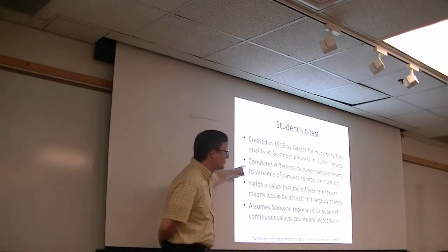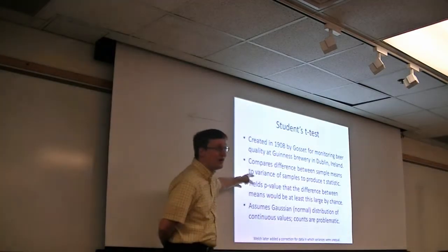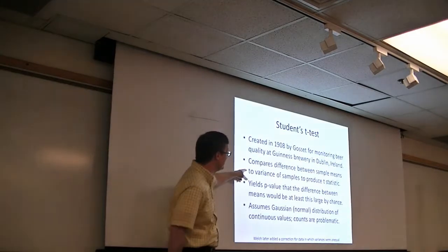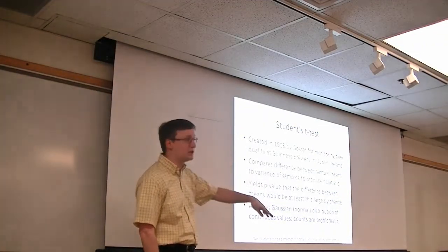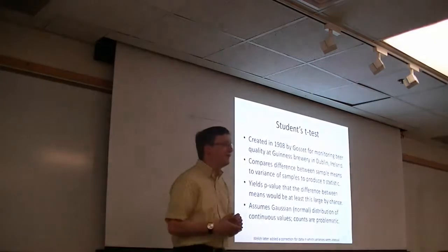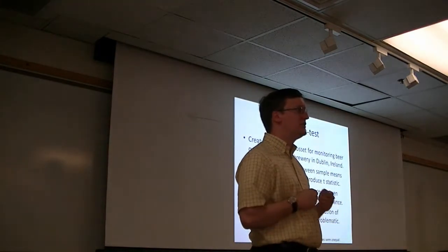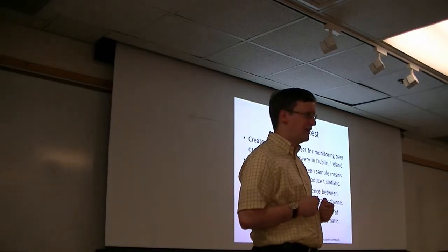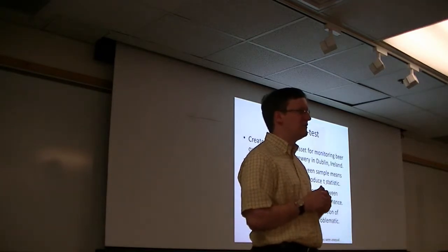So what we're trying to do then is evaluate the difference in means, taking into account the variance of the samples, or the standard deviations of the samples. That produces a t-statistic, and that t-statistic can be looked up to produce a p-value. So when you get a p-value, it does not go low to tell you that your hypothesis that they're different is correct. Okay? I'm sure we all heard that at least once in our college educations, but let's re-emphasize that.